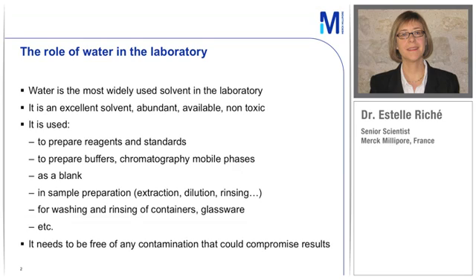And this is something to always remember. Please take care of your containers and glassware by using high purity water for the last rinse. It will prevent any risk of contamination of your glassware. We will talk about this further on in the presentation. What's really important for the water you use in your laboratory is that it needs to be free of any contamination that may compromise your results. And in the remainder of the presentation, I will explain to you how you can do this and get the best results.